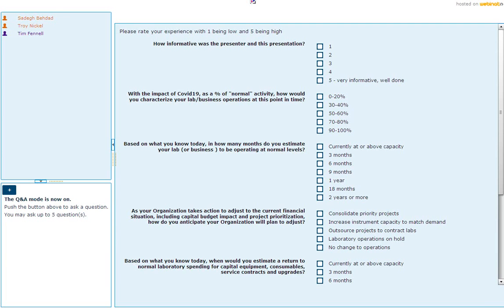Okay. Shifting gears to the dilatometry question, you mentioned TMA at the end and dilatometry before that. Can you just talk a little bit about the difference? They seem related, maybe where one is better than the other. A very good question. So these two instruments started in two different industries. So dilatometry comes from metals and ceramics, and TMA is more familiar with polymer audience. But they are basically doing the same thing in two different ways.